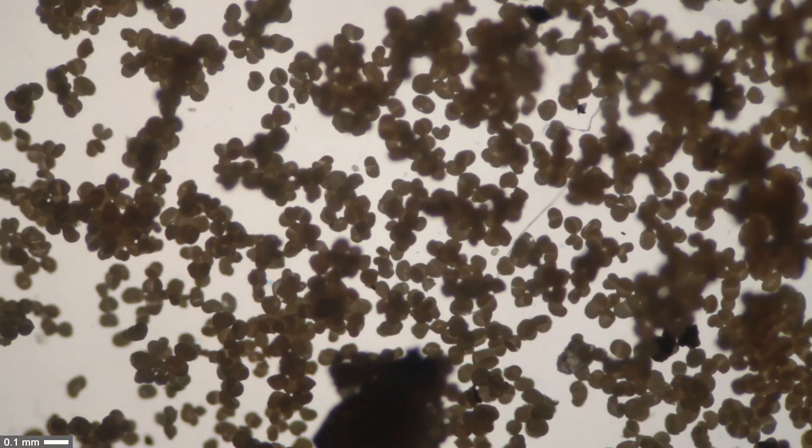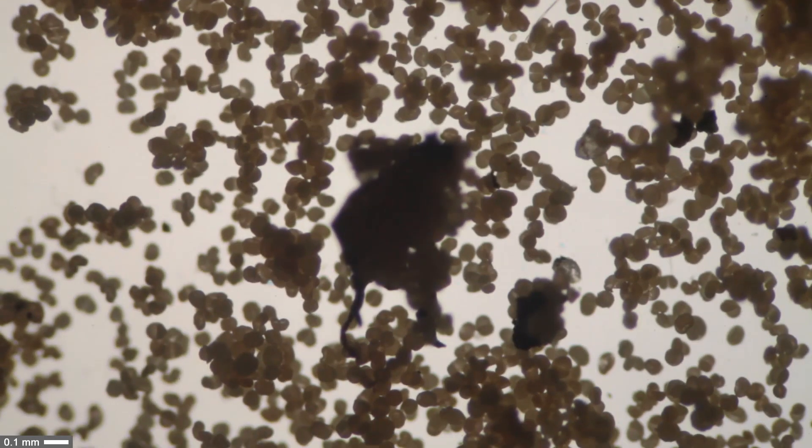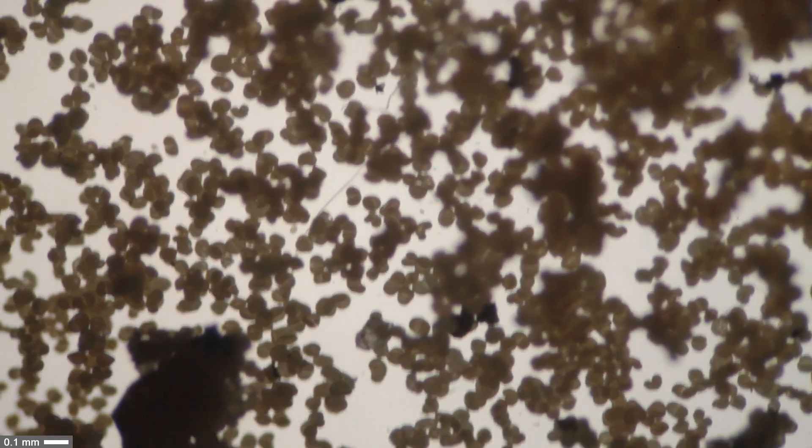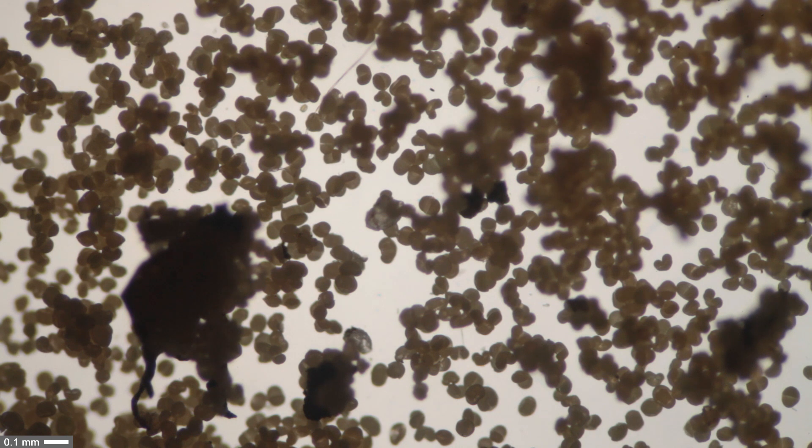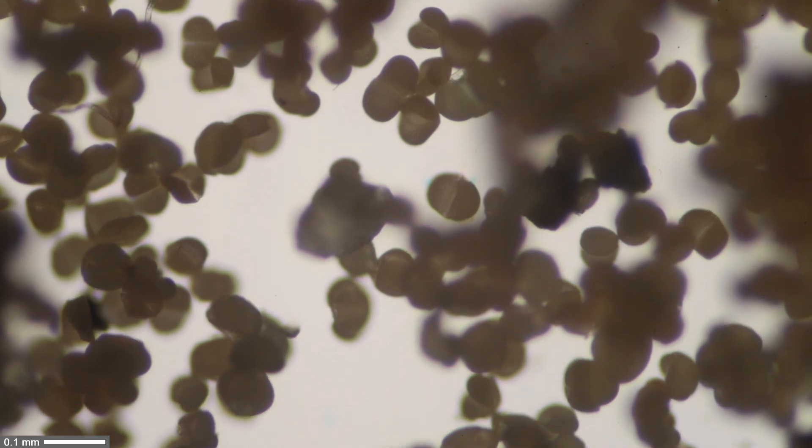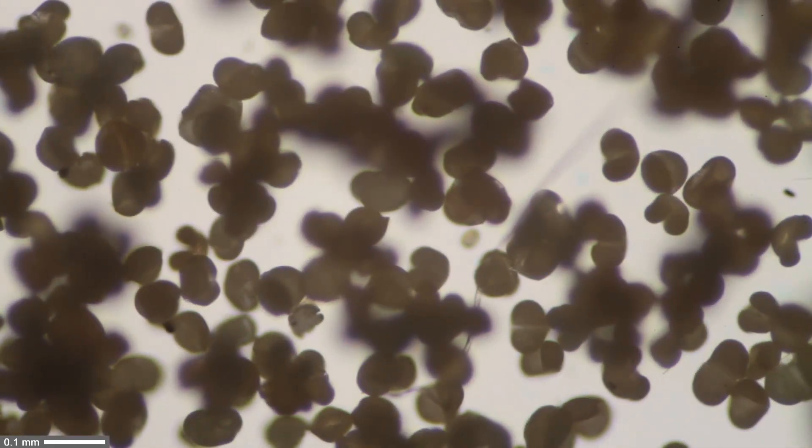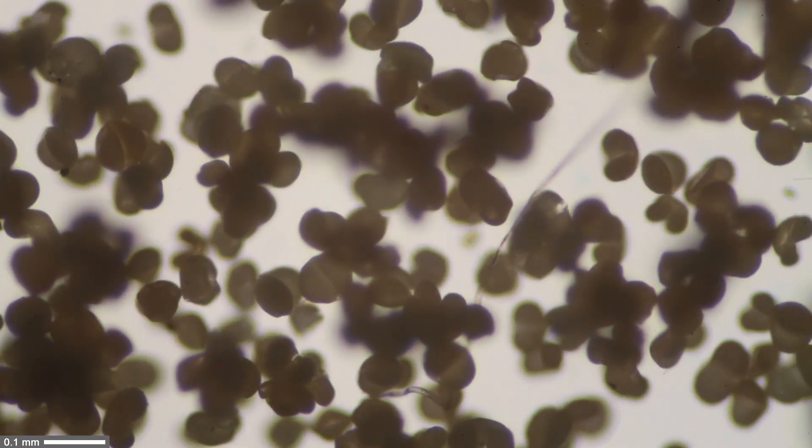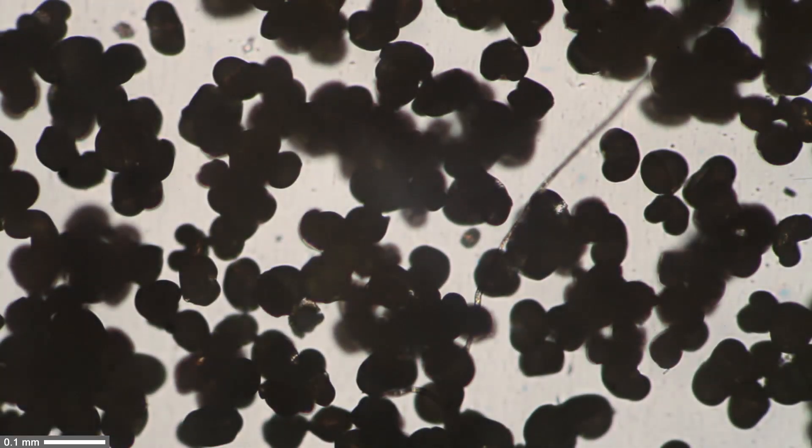Under the 4x low power objective you can see the dark large parts - I think that's some dirt and dust - but the pollen itself looks kind of small. With the backlight, the contrast is higher after closing the diaphragm. At the next higher magnification we start to see more structure, though there's still details missing. The string-like structure seems to be dust I also collected.